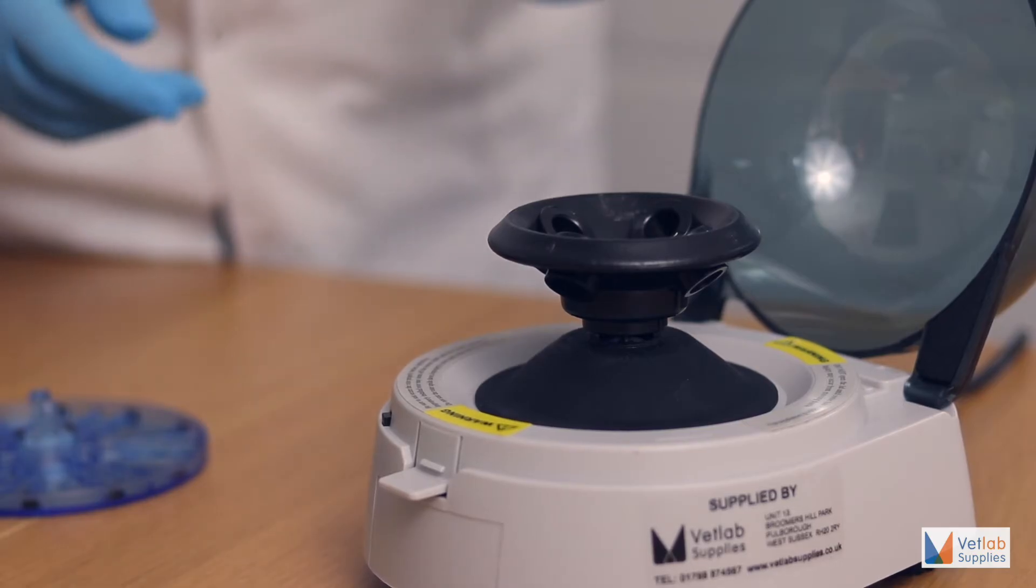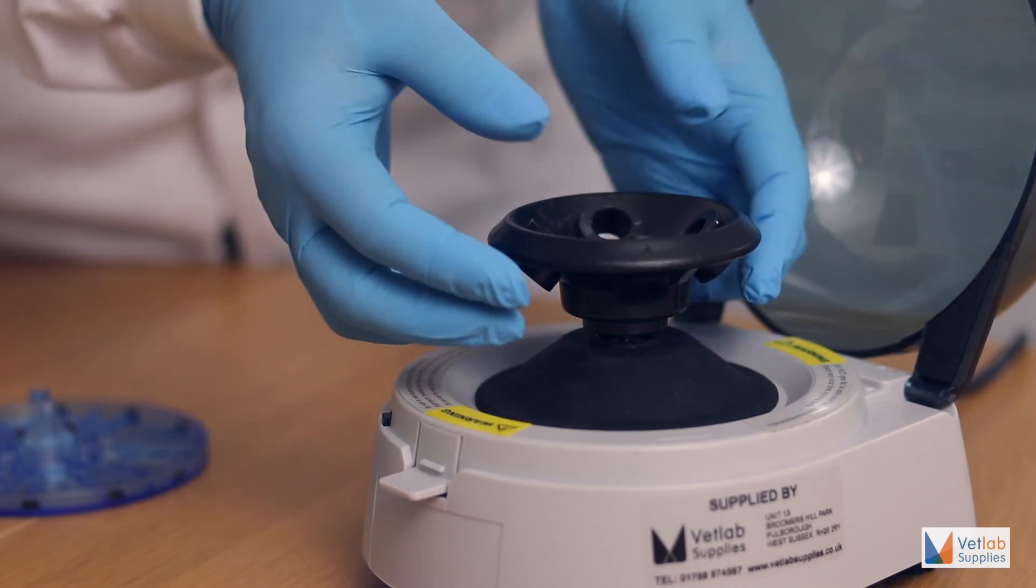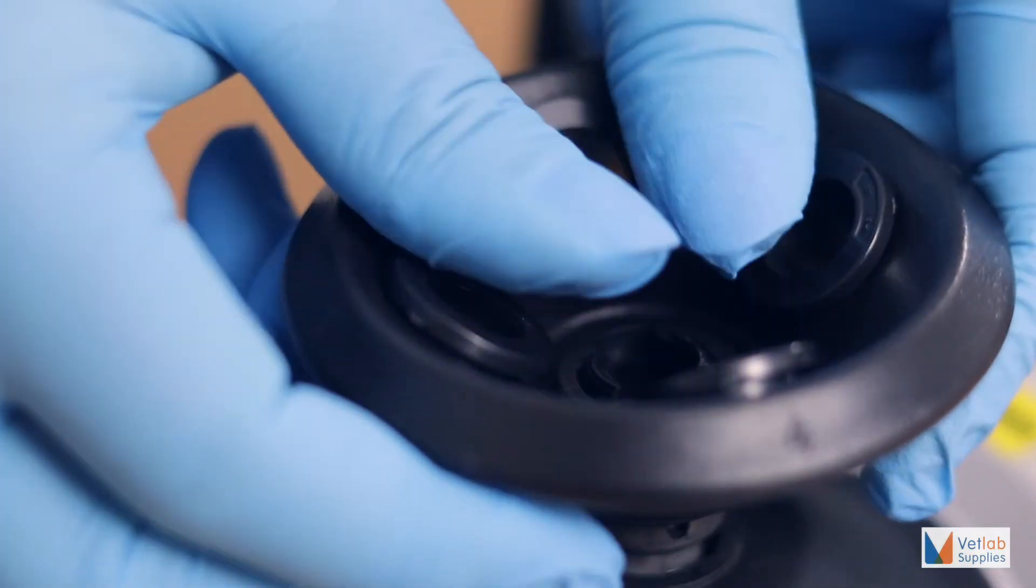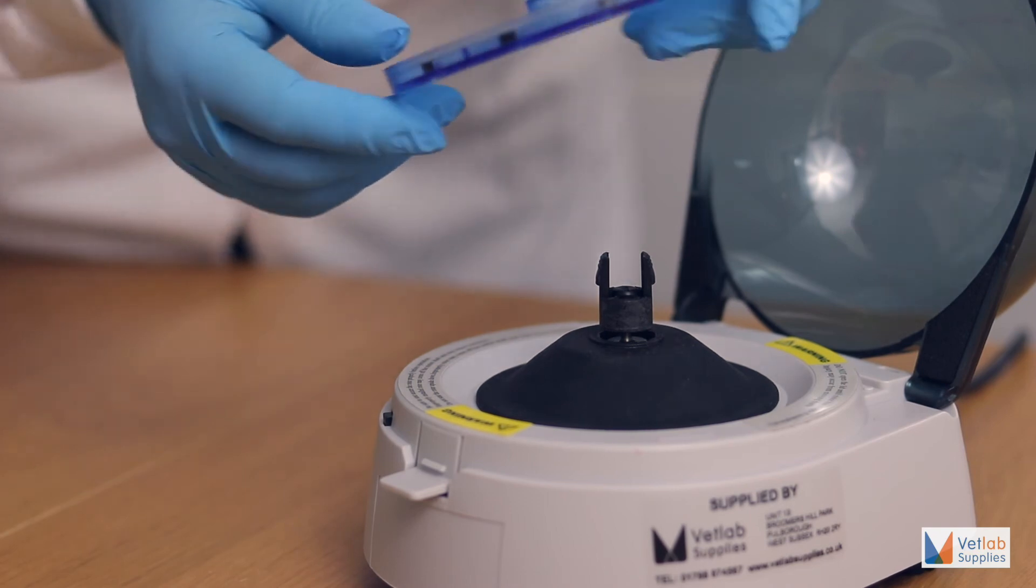The Vetspin Micro features a new rotor clip system that makes rotors simple and quick to change. No fuss and no tools.